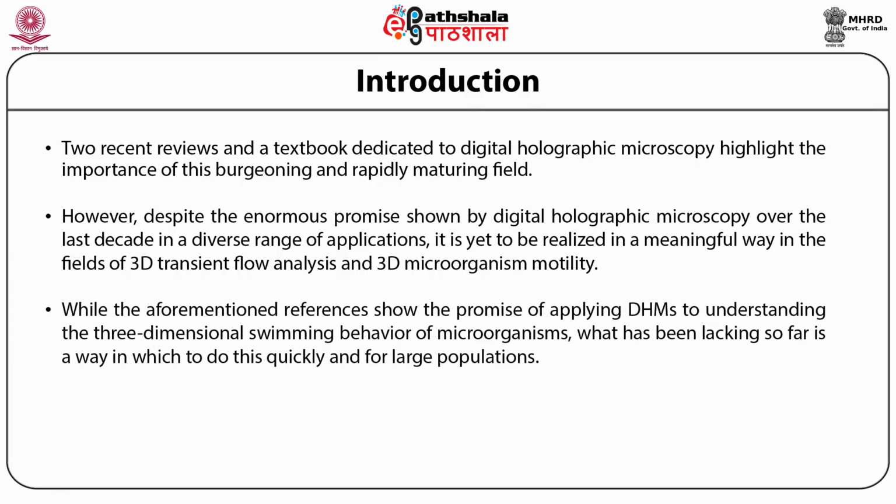While the aforementioned references show the promise of applying DHM to understanding the three-dimensional swimming behavior of microorganisms, what has been lacking so far is a way in which to do this quickly and for large populations.